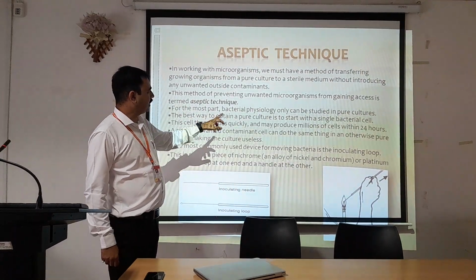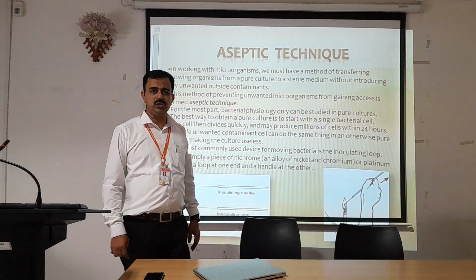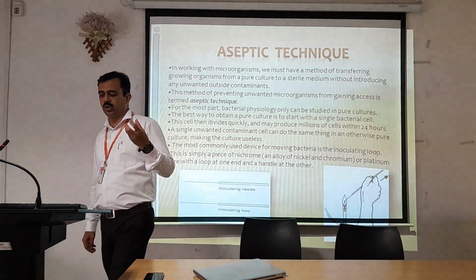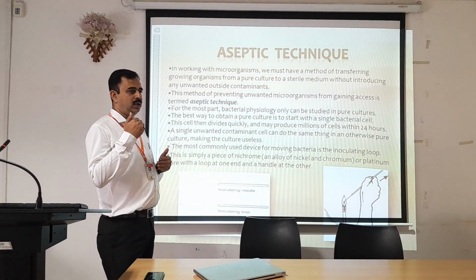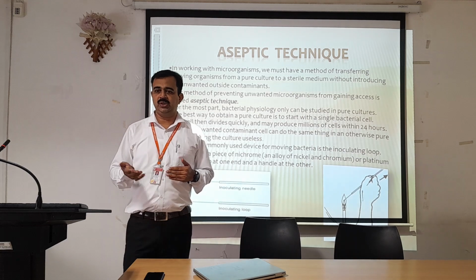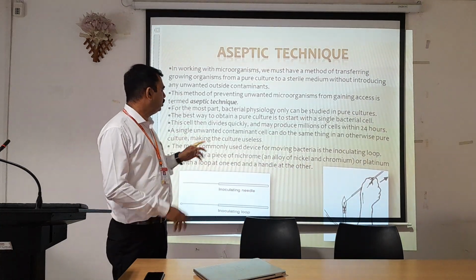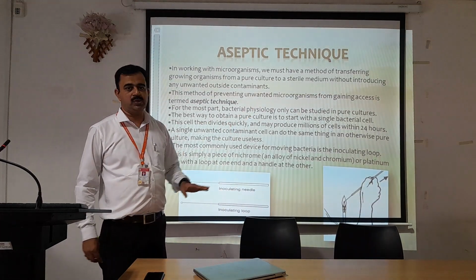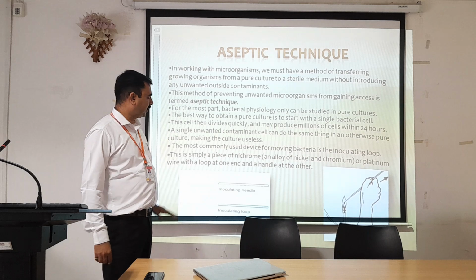For the most part, bacterial physiology can only be studied in pure culture. In order to study the physiology of a microorganism, its size, shape, morphology, what type of enzyme it produces, what type of fermentation it can carry out, we need to work correctly to isolate the pure culture. The best way to obtain a pure culture is to start from a single bacterial cell.